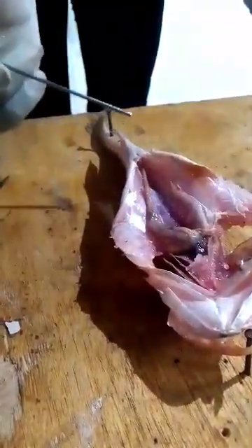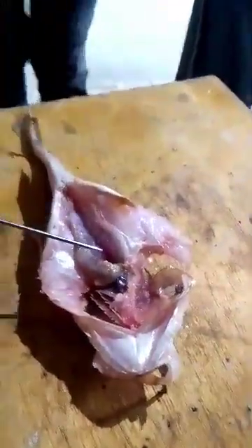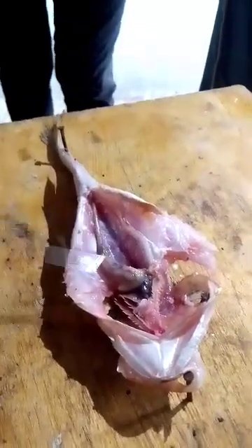Removing the swim bladder is very easy — you just pull it out like this and it comes out. Make sure you keep everything from the dissection. Now for the respiratory system: the respiratory system of the fish is composed simply of the gills, that's all.